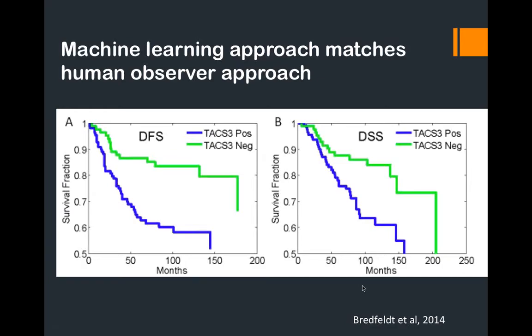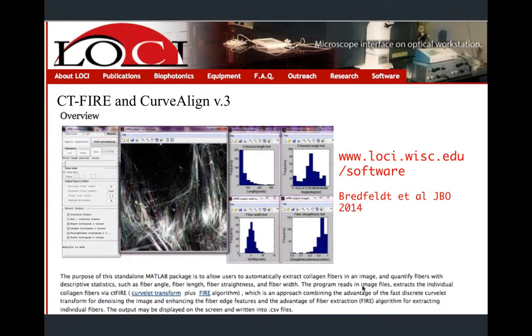If this is something that might help your work, we just wanted to plug this. It's open source, and it's located on the LOCI website, and it's CT-FIRE and CurveAlign, and it's a really powerful process of being able to convert these fibers into different relative alignments.